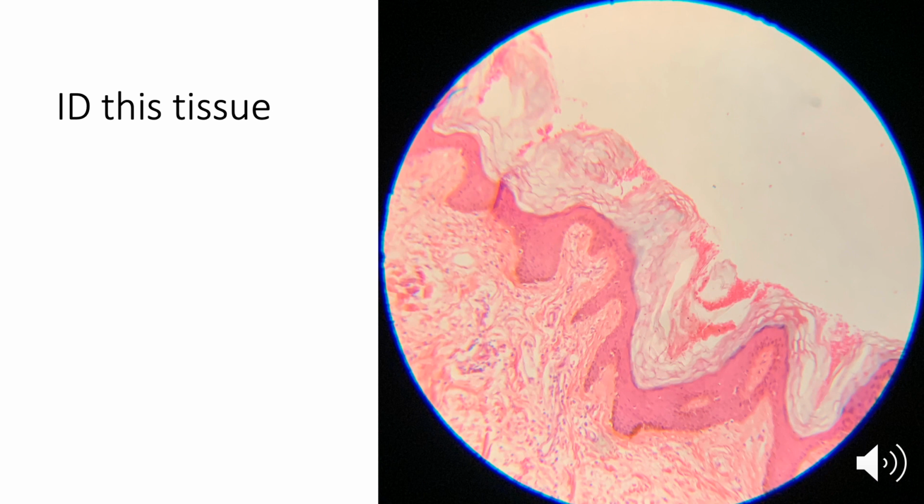All right, let's take a look at this tissue. First thing, does it have an apical surface? And I see that it does. Here's our empty space. This would be our covering, our outer surface, or our internal cavity. And then this must be our apical surface here. So I know I'm dealing with an epithelial tissue.